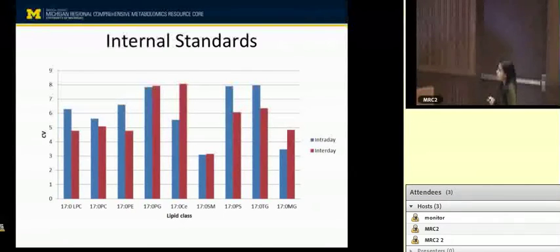And another variation is analytical variation that can come from sample preparation, or instrument run order, drifts due to batches. For this type of variation, we use all our three types of controls that I discussed: the internal standards, and then the quality control samples. Once we take care of these variations, this improves the downstream statistical analysis a lot, because we are able to separate the biological variations from this systemic variation.